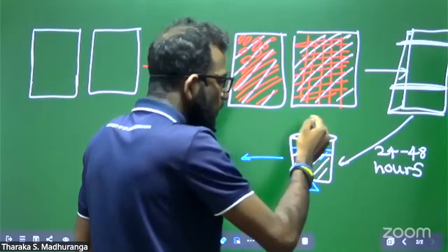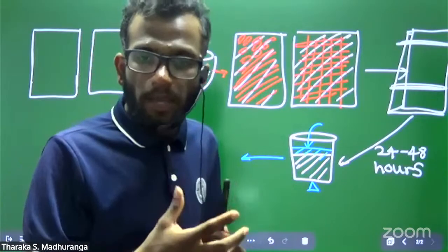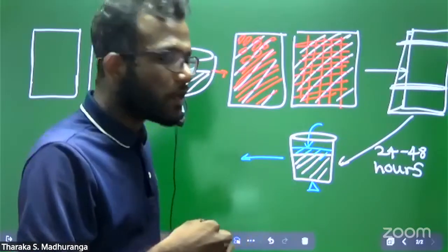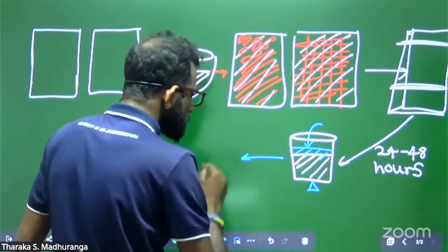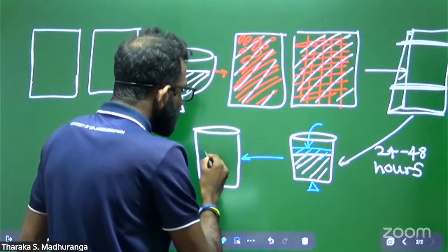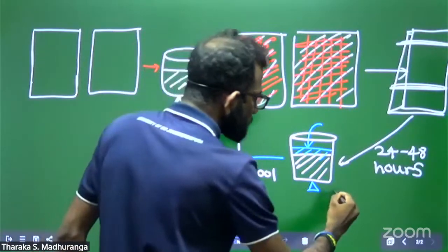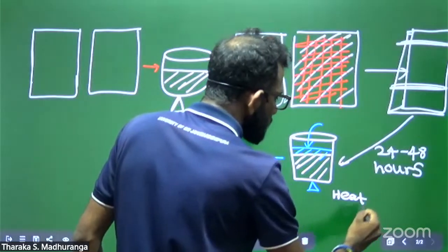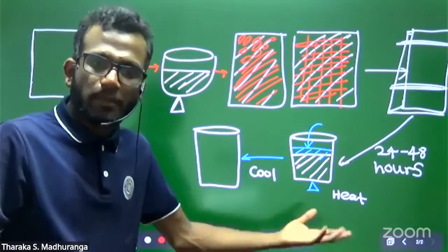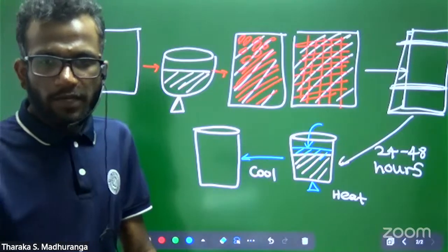All the ethanol, paraffin wax, and the compound in the paraffin wax become the same solution. After that, this beaker needs to cool. Again heat carefully and melt the solution. Then we completed the practical.